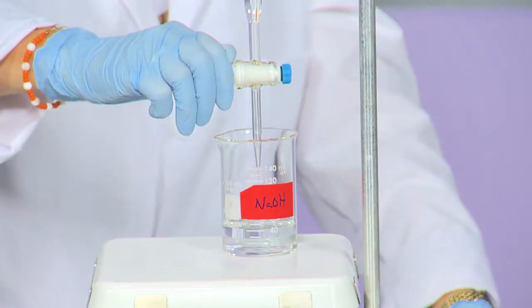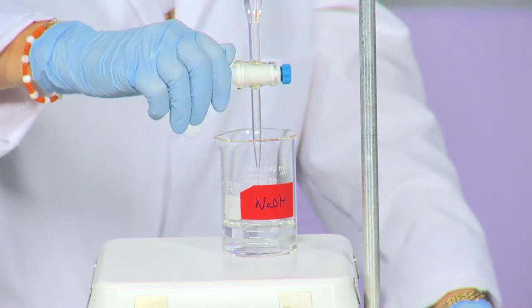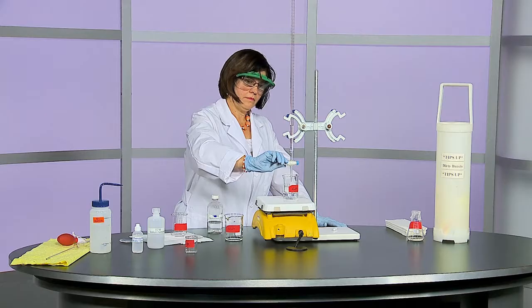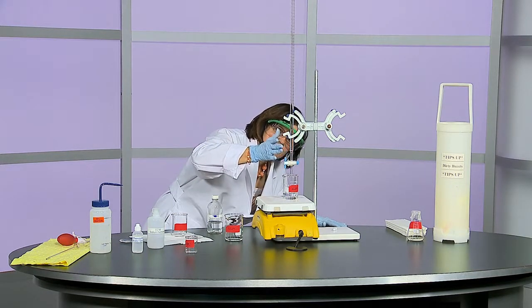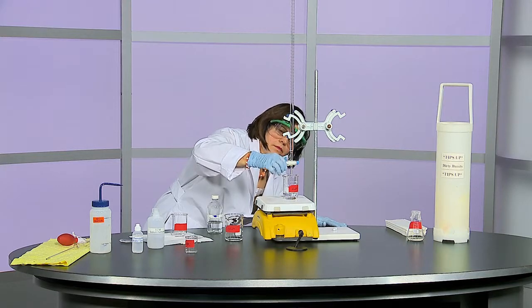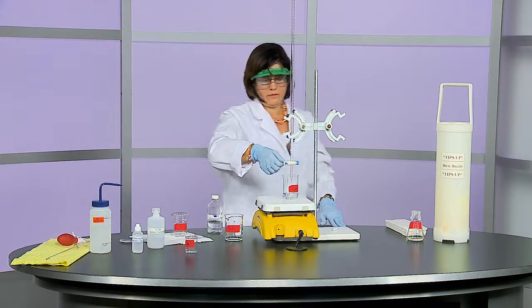Open the valve so the tip is filled with solution. Don't allow it to completely empty out. Look closely just below the valve. If there is an air bubble, tap the burette to see if it comes out. If not, ask your professor for help.